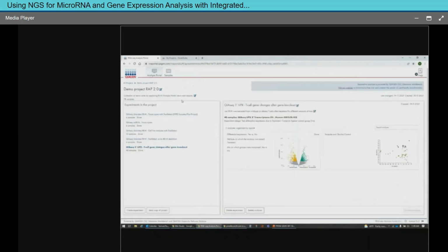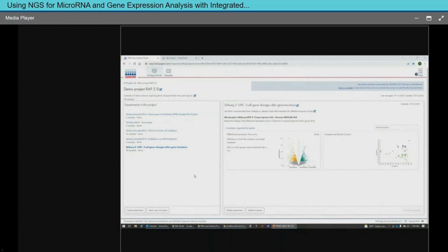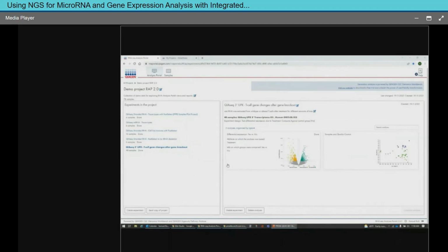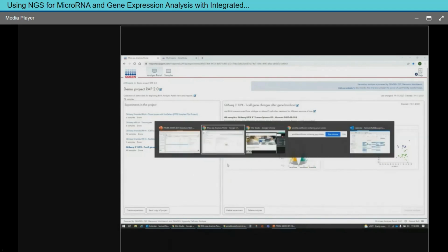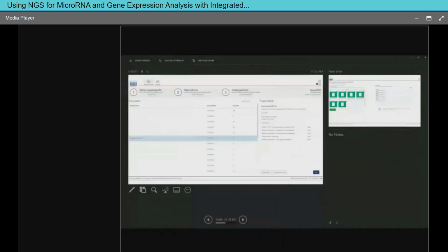If we think about that gene expression work, we can basically take the same workflow. We've isolated the total RNA using the miRNeasy kits. We can take an aliquot of that. And then what becomes important is what type of library prep are we going to use? Are we going to use a stranded kit, or are we going to use a 3' sequencing kit? So let me slide my slides back over here for a second and reverse this.